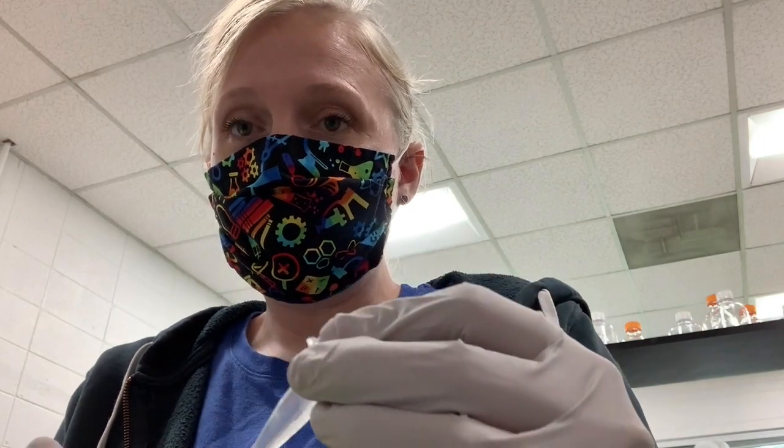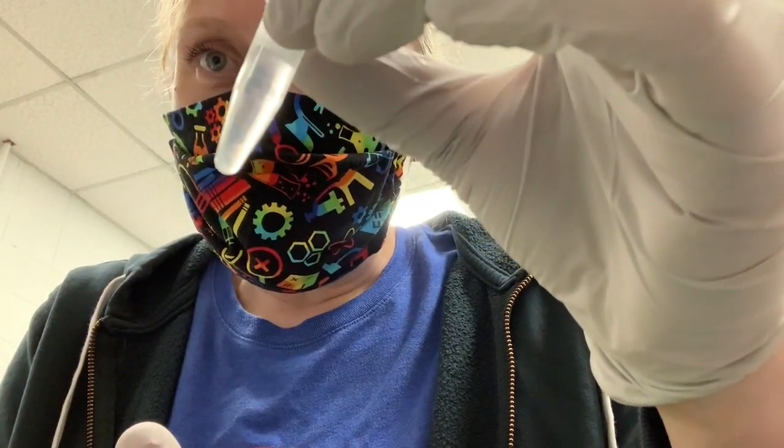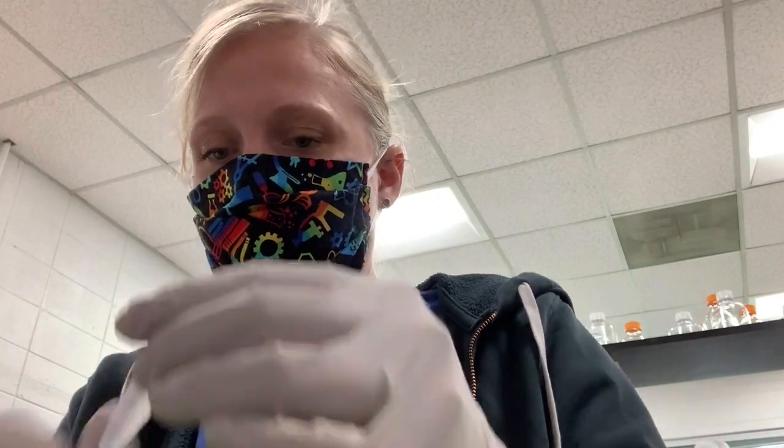Okay, so I've removed my samples from the centrifuge after the first spin. And I'm not sure if you can see, there's kind of a whitish clear pellet on each tube.